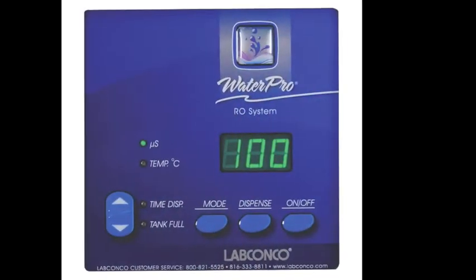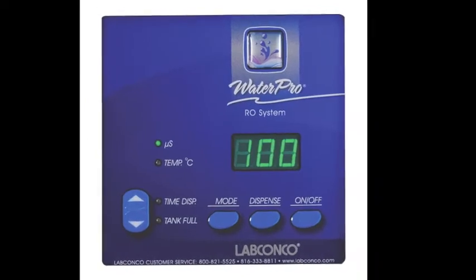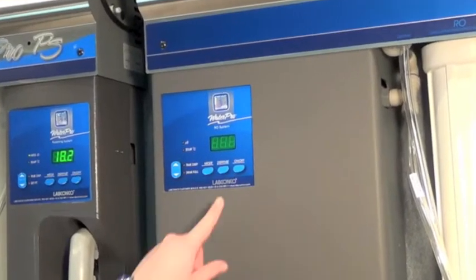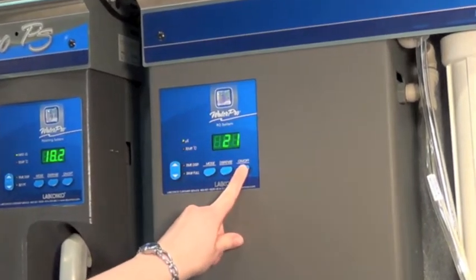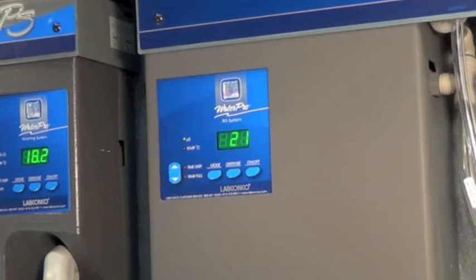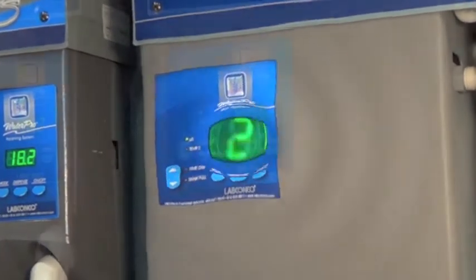Operation of the WaterPro RO is controlled via the display board. The on-off button turns on the unit and lights the display. When the switch is in the on position, the pump will automatically flush for three minutes after every 12 hours of inactivity.